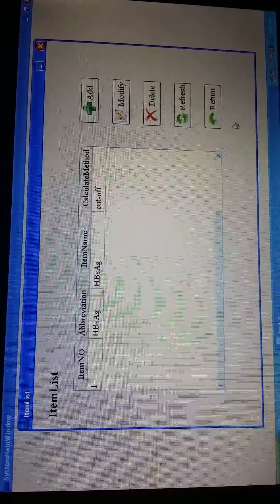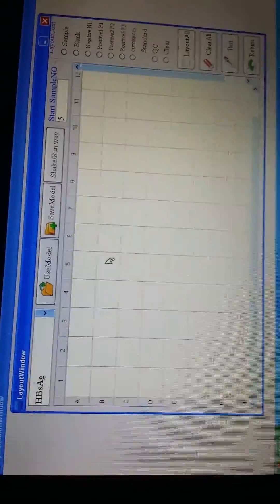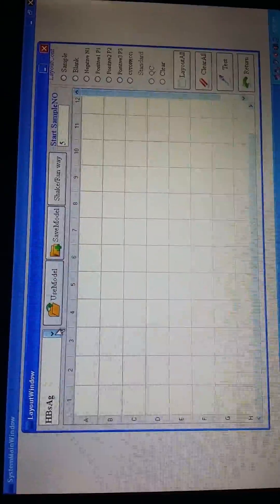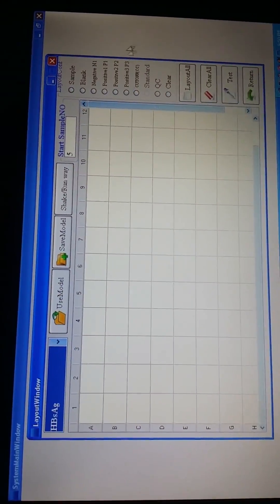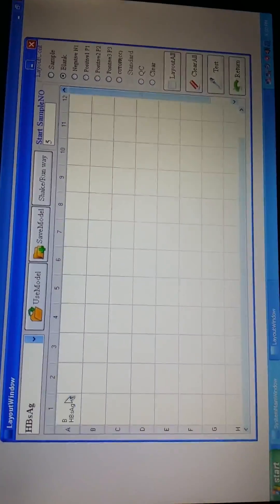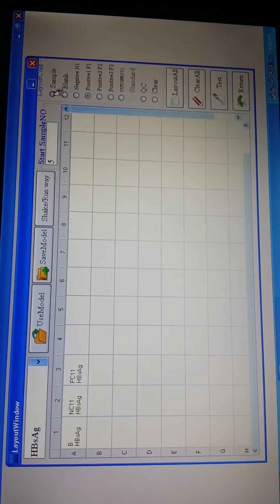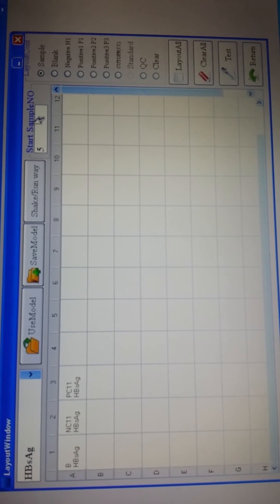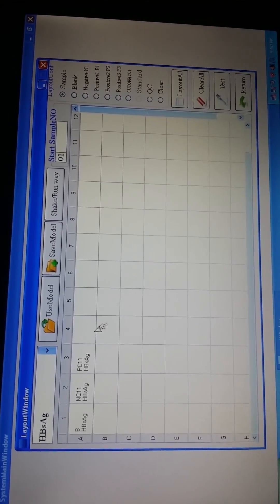Let me show you how to test the samples. From here, go to sample testing. After we get the sample testing interface, we can choose the item we want to test from the right corner. Then we should choose the blank, negative, and positive controls, and then the samples we want to test. After choosing the samples, you will see the sample numbers — you can put in the numbers as you want. We just put in 01, and you can place the sample here or here as you like.